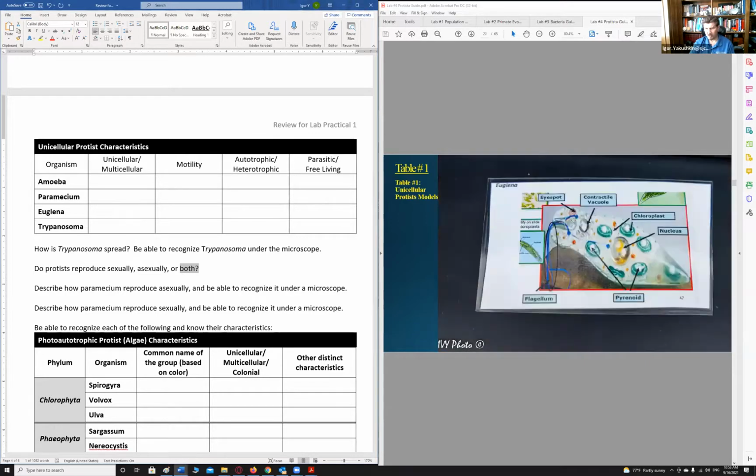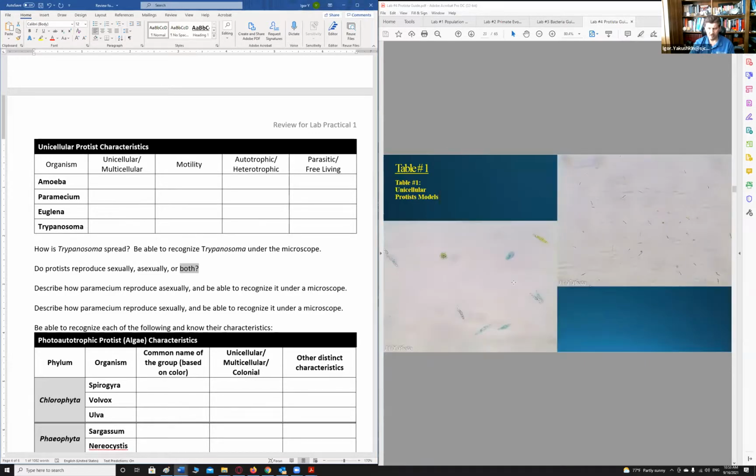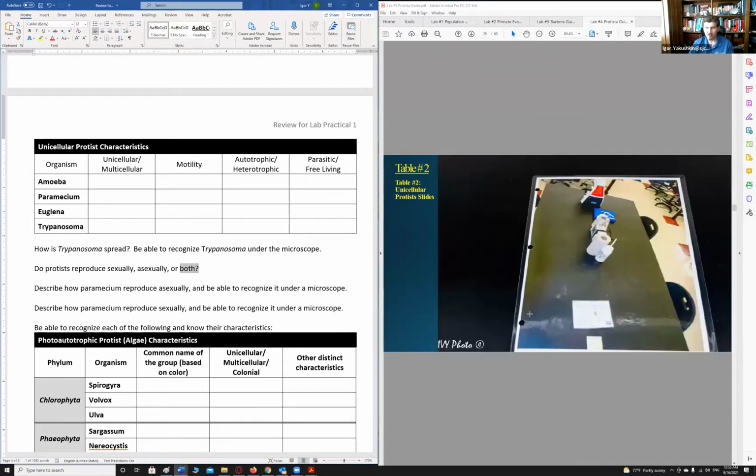So here we're looking at the euglena. Euglena under the microscope, as you can see, are drastically smaller than the other one. On this one, you can kind of see the flagellum, very thin, and it's constantly beating. Under the microscope, it's kind of hard to get it. But you also can see that red spot right here. So this is where the flagella is located. That's the front end of the creature.